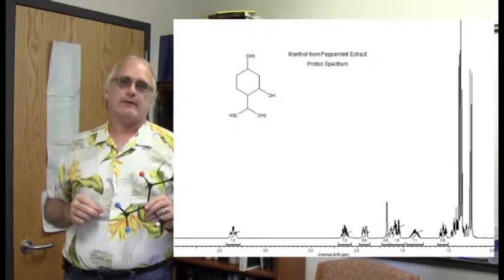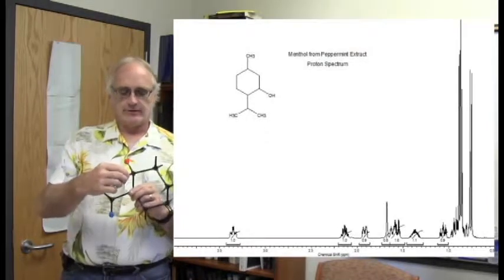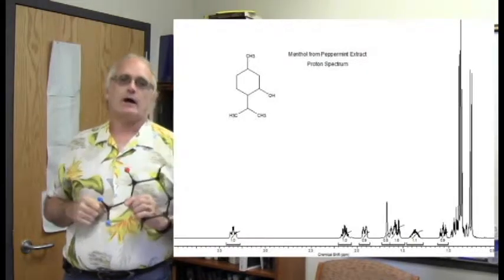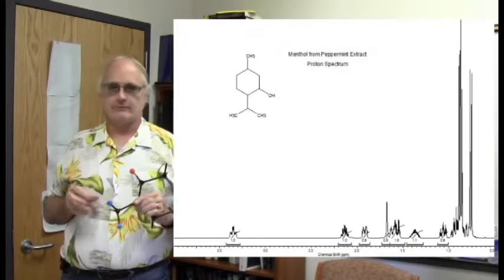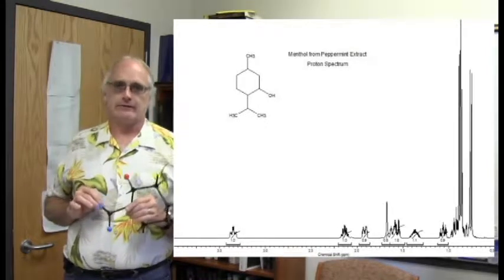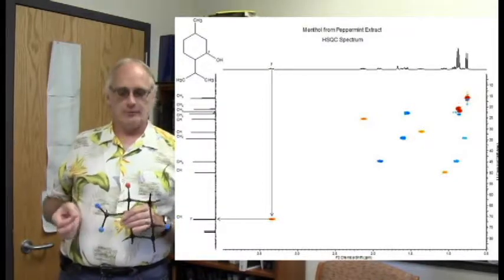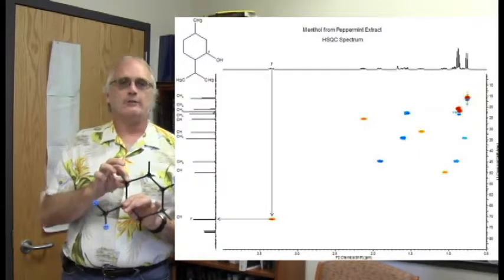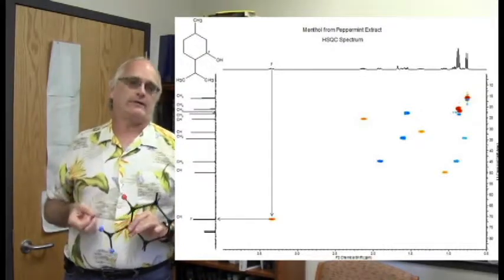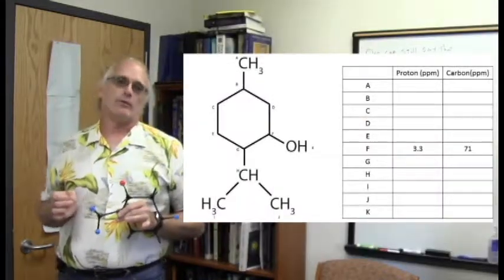And if I look carefully at proton F, it seems to have a triplet of doublets-like appearance to it. Triplet of doublets, 2 protons here, 1 proton there. We must have 2 of these coupling constants nearly the same to give a rough triplet, and then a doublet, so 1 coupling constant must be quite a bit different than the others. And then I use the HSQC and its ability to correlate to find the carbon that proton F is attached to. Carbon F down here, and it's no surprise, it correlates very nicely to a CH and the most downfield CH that we see in the carbon spectrum. It's no shocking surprise to see that, but it is nice when it works out.